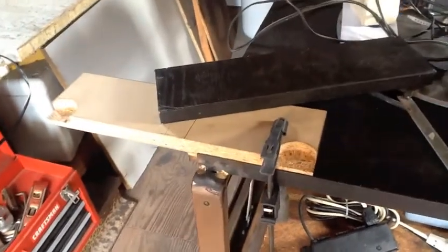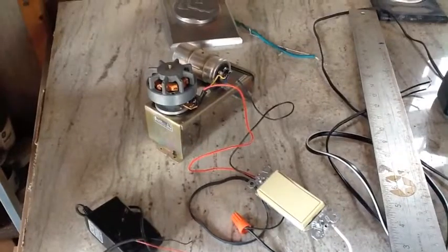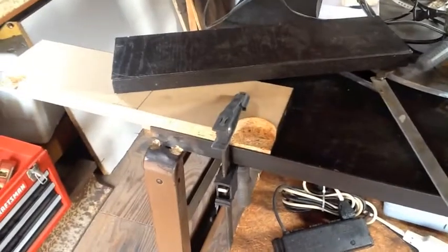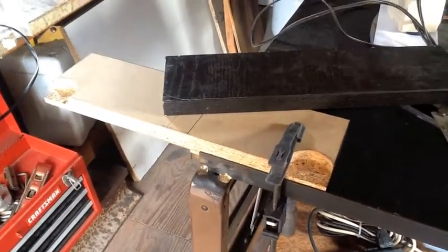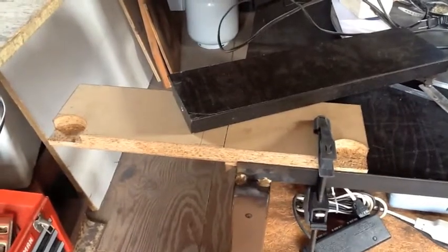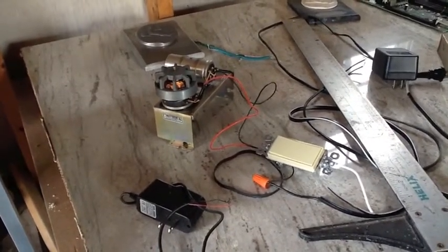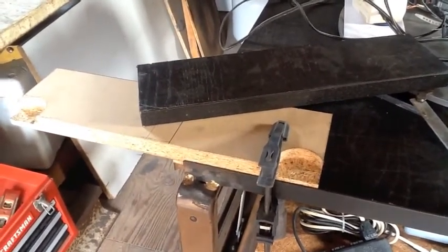Hey everybody, Florida Fisherman here. I was looking at some scrap wood and this motor, which I got running and wired a switch into, and I was thinking about making another magnetic stir plate for mixing up e-juice. This motor is a little bit more powerful than the other one I have, which is basically a computer fan. So I think I'm gonna take a stab at another one and bring you guys along.